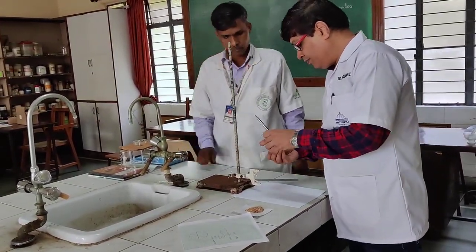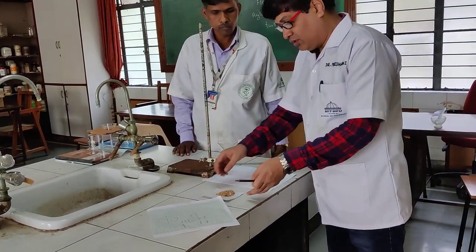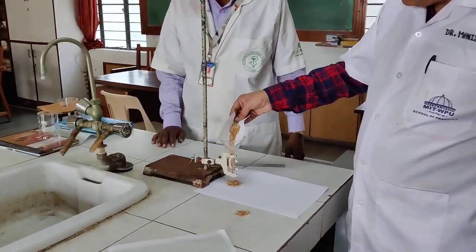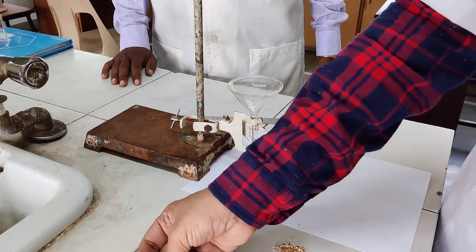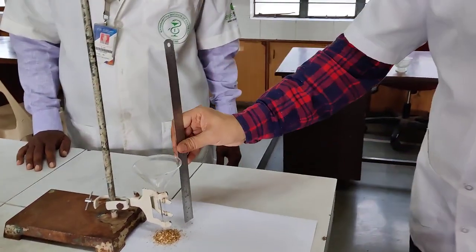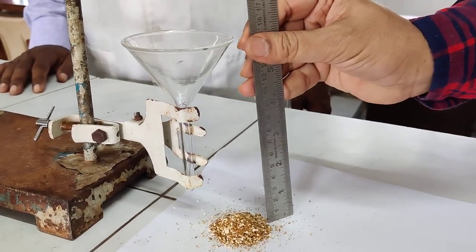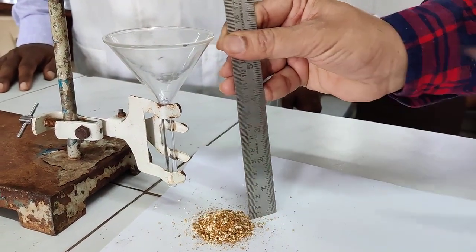Just for an example, the amount of granules is less, and this is just the heap that is being formed. So the heap formed over here is less. So what you can do is you can also measure the height of the granules in this case. In such a manner you can measure the height of the granules also, right? You can measure in this way what is the height of the granules.